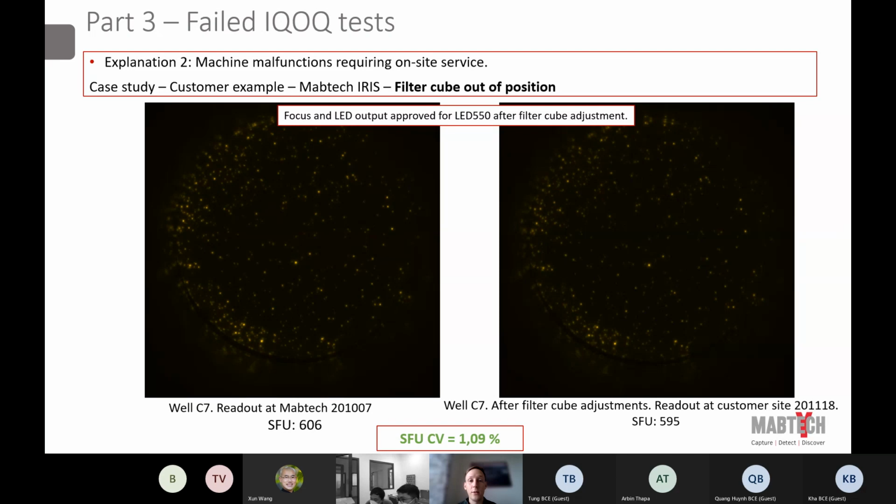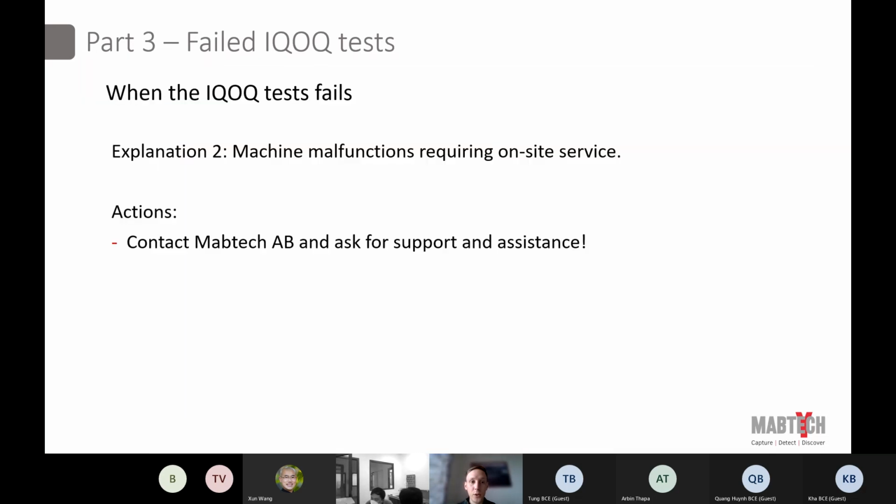They are very positive that it's robust, but it's good to be aware that you need to analyze and have a quality-minded approach when approving IQOQs. So if you are hesitant about the performance of your reader, in the beginning we're going to help you with that process, but in the future you're going to take it over from us.